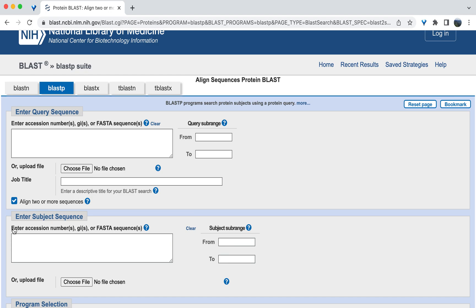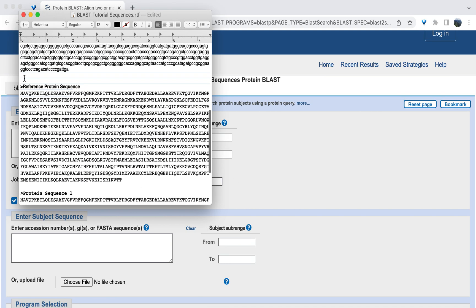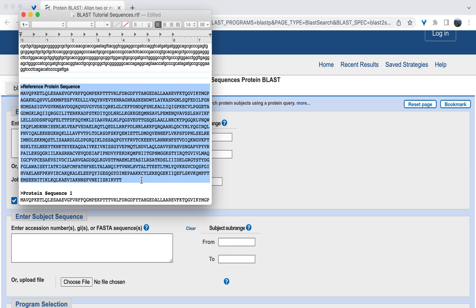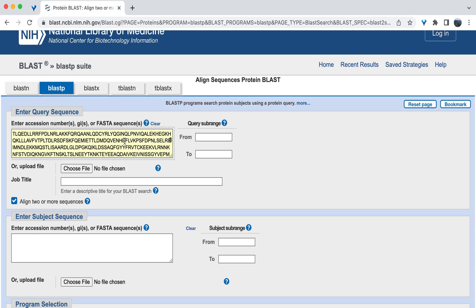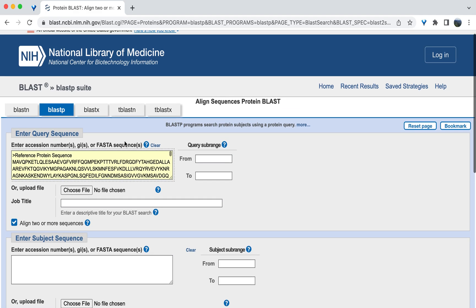To do this, we must enter the reference sequence into the large box under enter query sequence. This will be the query sequence. I'm going to copy and paste the reference sequence for the protein into this box. Here's the reference sequence. Copy and paste. Be sure to always include the description line, which begins with the greater than sign.